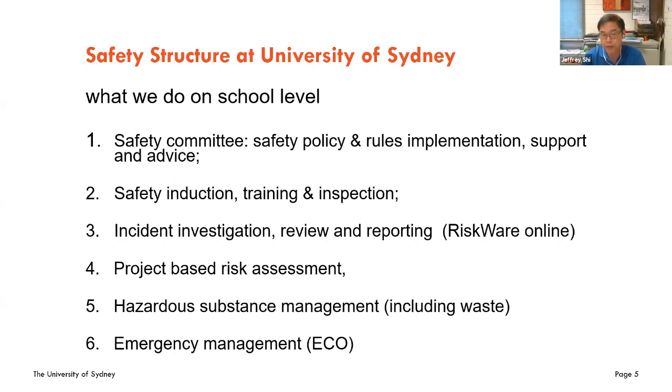Students and staff must go through the risk assessment and get a permit to go ahead before they are allowed to work in the laboratory. We are also responsible for hazardous substance management: procurement, handling, use, safe storage, and waste disposal in this particular school.